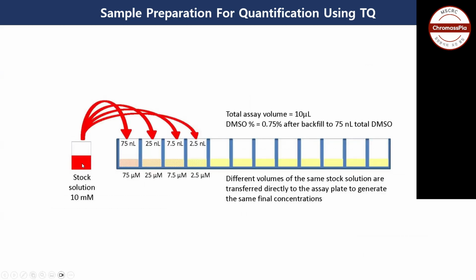Actually, this is a stock solution. And from this stock solution, you can take different amounts and you can dilute them directly into different other vials. And this will be your sample preparation technique for the TQ samples. And after this, I will show you how you can do the quantification and how you can draw the calibration curve. And it will be done using the recorded video, which was recorded by Anjan. So now I will share that.